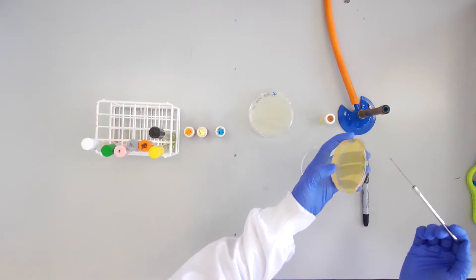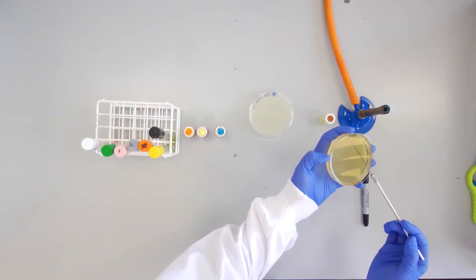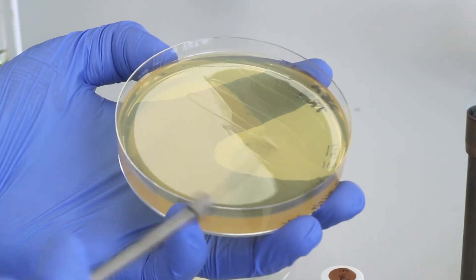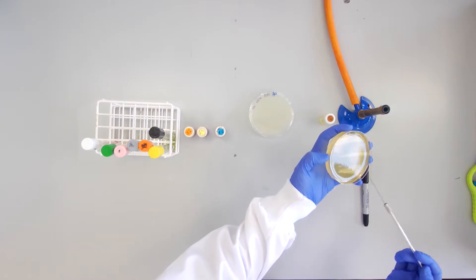Next, make a single zigzag streak on the 4% tryptone plate which is labelled TRY.